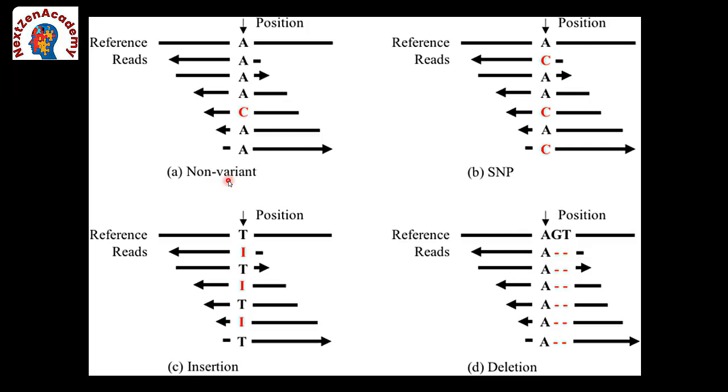This is just an example from an IGB viewer, where you can see the set of gene positions and genes, and how the variations happen in each sample.